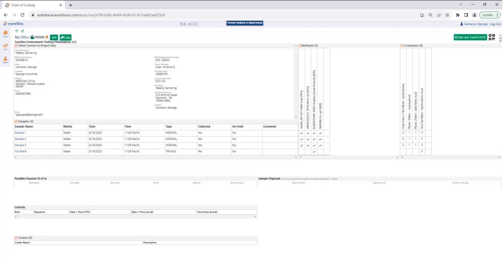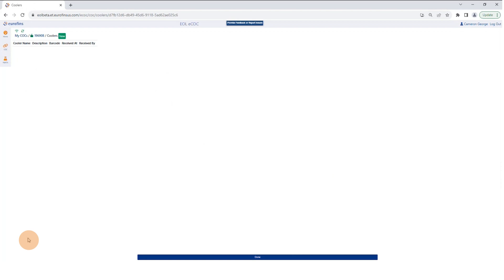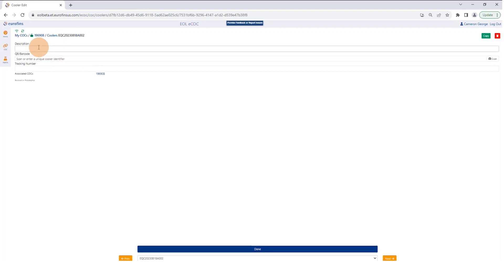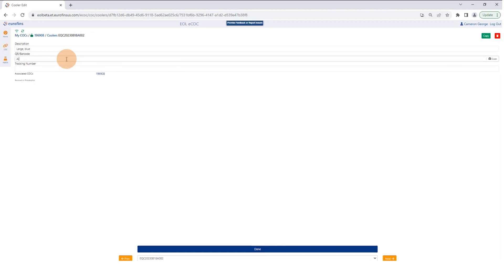Once you've confirmed that everything is as you want it to be, you have the opportunity to go into the cooler section and add information about a cooler. Hit New to add a cooler and put in a description — I'm going to call this one 'large blue.' The next field is a QR barcode field where you can enter information so the laboratory can identify the cooler. You can put a QR code or barcode label on the outside of the cooler and hit Scan to associate this eCOC with that cooler. You can also type in a unique identifier, like 'alpha-1,' mark the cooler accordingly, and the laboratory will be able to associate them that way as well.